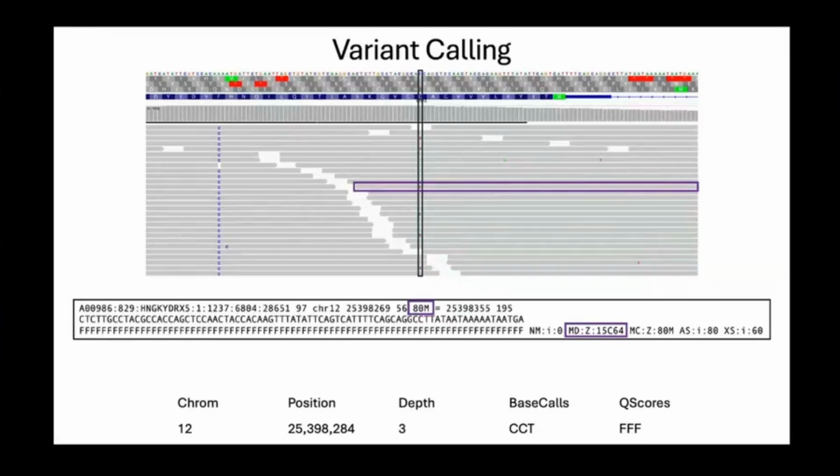And at the end, a variant call decision will be made for each genomic position in our assay using this pileup information. And it may or may not include a p-value based on the level of evidence, et cetera. I do think it's generally a good idea to have some kind of system that upfront eliminates bad quality base calls and works with only the good stuff.